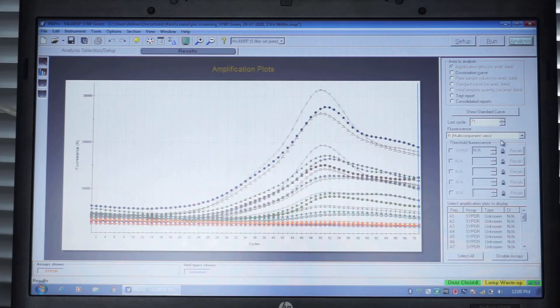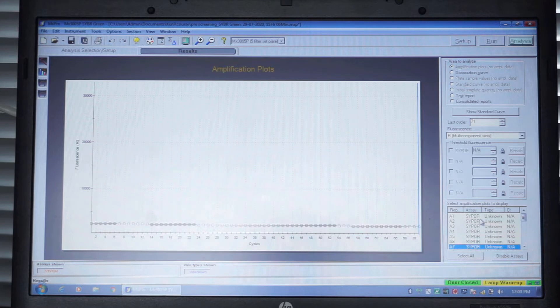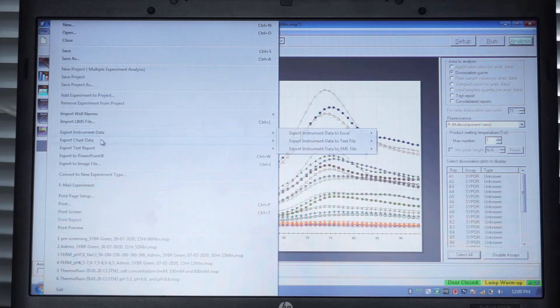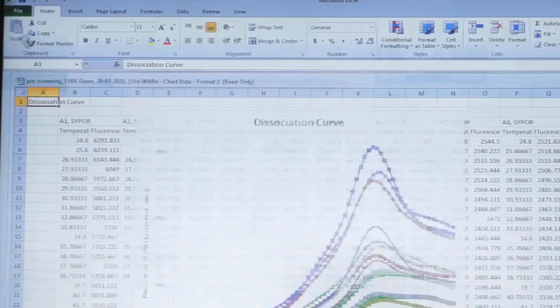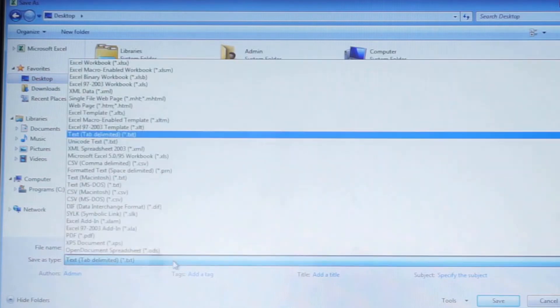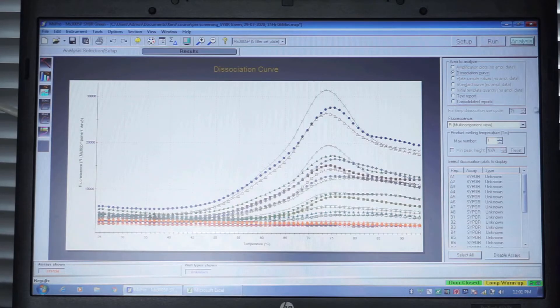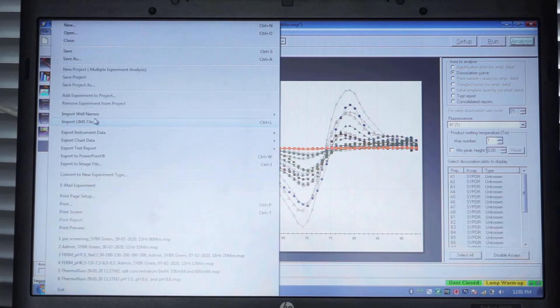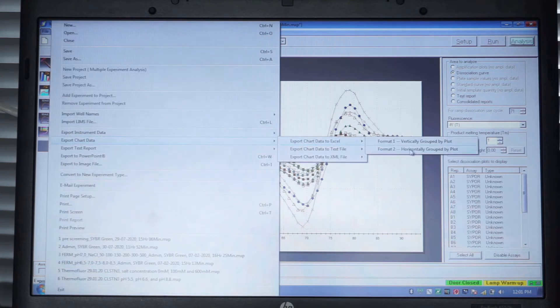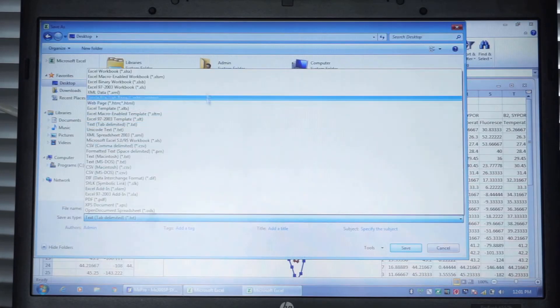After finishing, click on the tab Results. Tick Amplification Plots from the options on the upper right corner and select Multi-Component View. From the main menu, select File, Export Chart Data, Export Chart Data to Excel, Format 2, horizontally grouped by plot. Excel will open and the file can then be processed further. Next, select the tab Results again. Tick Dissociation Curve from the options on the upper right corner and select minus RT. From the main menu, select File, Export Chart Data, Export Chart Data to Excel, Format 2, horizontally grouped by plot. Excel will open and the file can be processed.